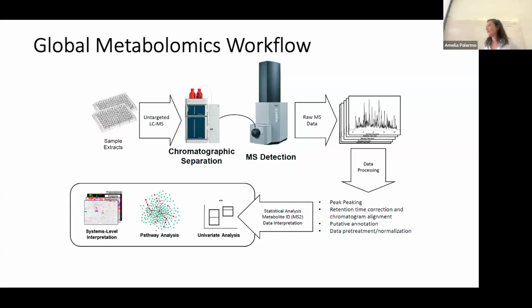I would say this is a big difference of metabolomics compared to other omics sciences, like transcriptomics and genomics, that have more unbiased coverage, where the discussion is mostly in terms of depth of sequencing. Here it is more about the chemical-physical nature of what we want to measure, and how the technique that we use for measuring that is introducing a slight bias in what we can measure in the frame of that specific analysis. So the sample prep already dictates what you're going to see later, right?